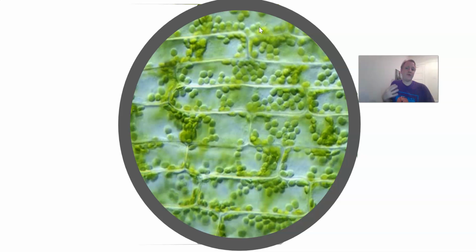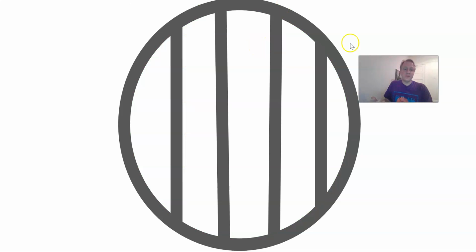But that's the basics of how you go about estimating these things, okay? You put a ruler down flat on the microscope so you can see how large your field of view is, and you should write that down for low, medium, and high power. Don't go to the 1000x. Don't go to the one that has 100x written on it. If you have that, you're not going to be able to see anything. It's going to be too large. We aren't actually going to use that one. Most of you, or at least some of you, don't have that. So yeah, that's how you estimate that. As always, shoot me an email or let me know if you need anything.